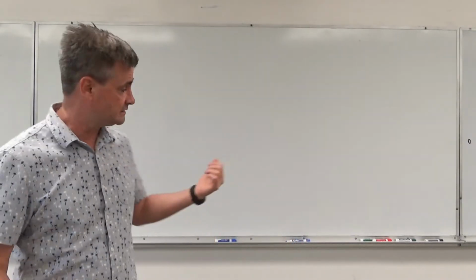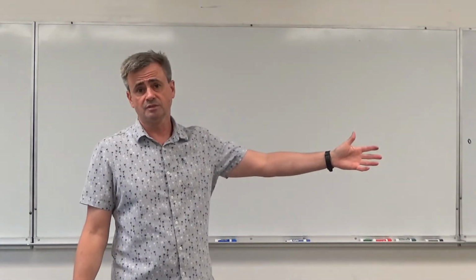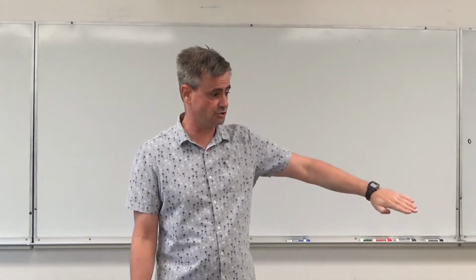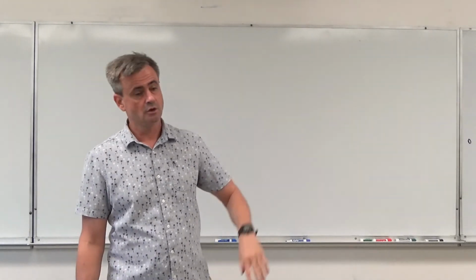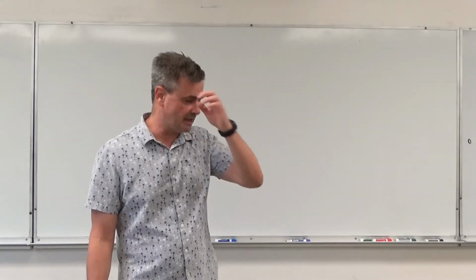Okay? Then this type of task, if you were going to describe it over the entire length of a reaction, becomes a lot more challenging. Then you need to figure out some mathematical equation to describe your curved line of your concentrations. Okay? And then your rate at any particular time would be the tangent, all that stuff.